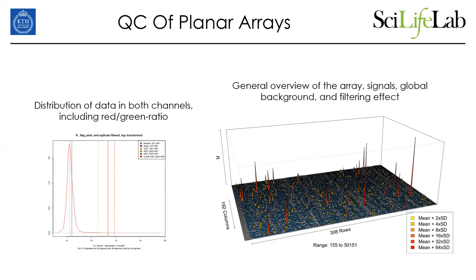We also do a general overview of the array. You can see the signals, you can see the global background, you can see any filtering effects, just to get a feeling for how well the arrays have performed. And if we can see that this is not something that we can actually use, we just redo the experiment. The slides for us are a resource that we are not too careful with, so we can spend a little bit of them.